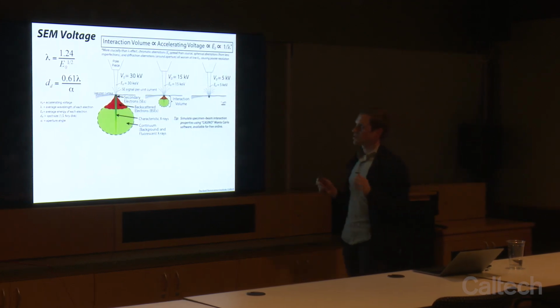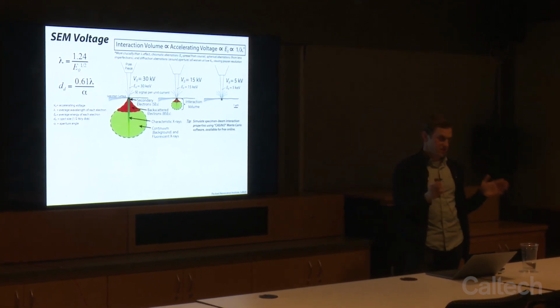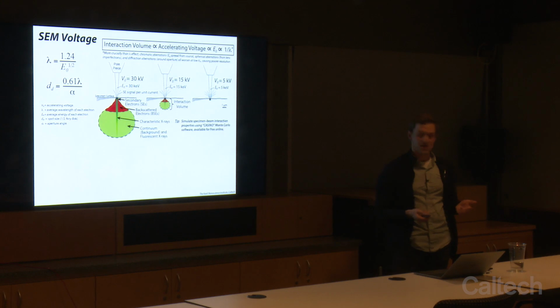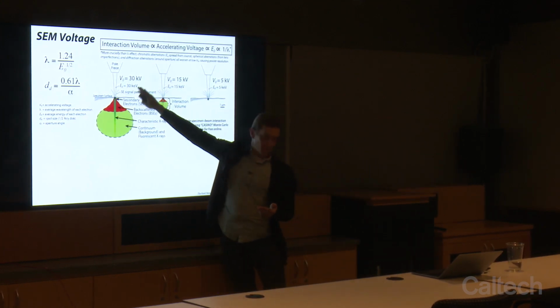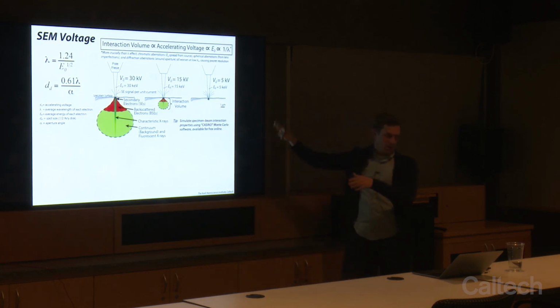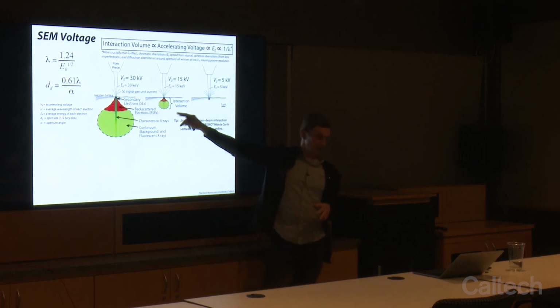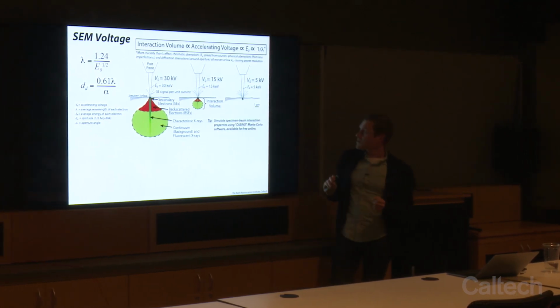All right, so probably the most important parameter is the voltage, and this is usually what you want to decide upon first when you're looking to optimize your image. So the voltage controls the energy of electrons in your system. On a typical SEM, we will have as high as 30 kV accelerating voltage and as low as maybe half a kV, or maybe 0.1 keV or even lower. And so if we have 30 keV, then on average, each electron has 30 keV in energy. 15 is 15 keV, 5 is 5, okay?